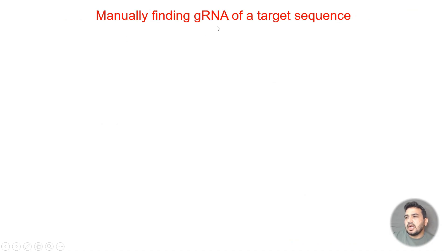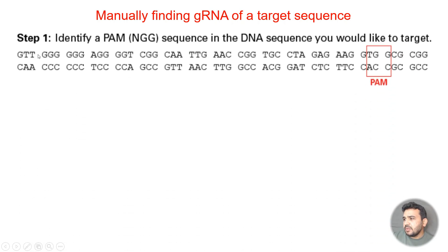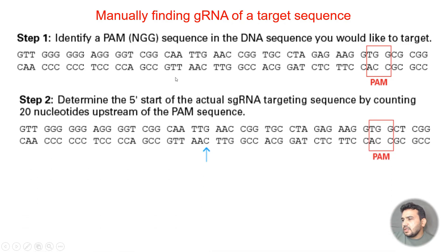So how can we manually find the guide RNA in our target sequence? The first step is to find the PAM sequence. As previously explained, the NGG sequence is the PAM — here you can see this GG. If we consider this the plus strand and this the minus strand, on the plus strand here is GG followed by T, so we can take any GG as a PAM sequence.